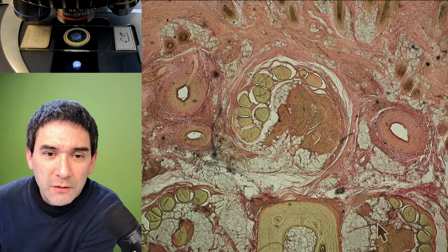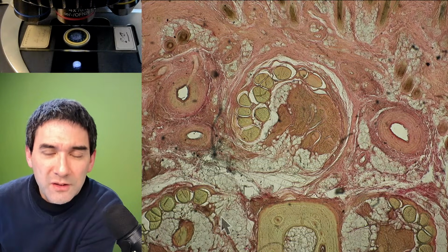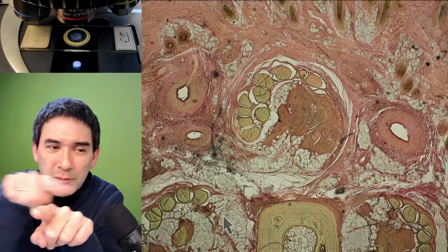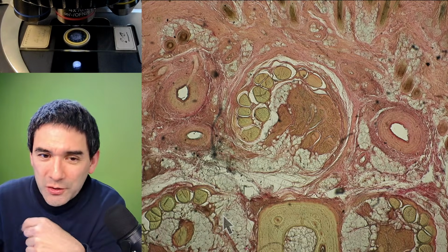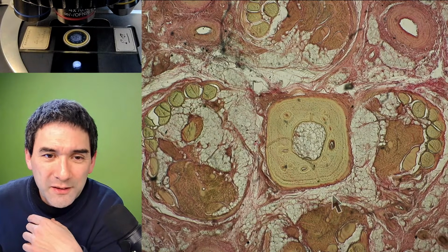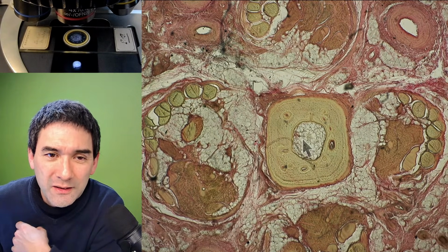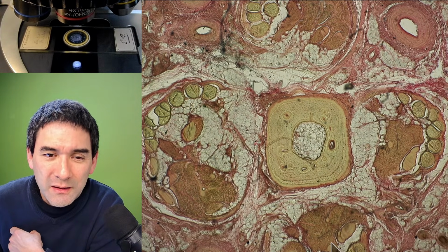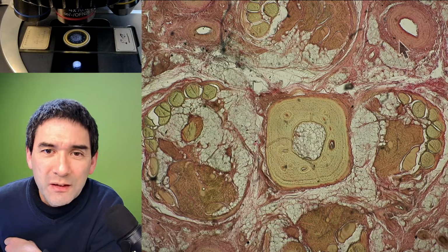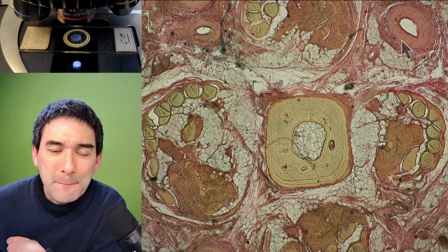You've got muscles over here. So it's kind of interesting. You've got basically a pair of muscles that are moving it like this, and a pair of muscles that are moving it in XY direction. Here in the center is the bone of the tail, and that seems to be the marrow. Again, muscle down here, up here, left and right as well. Those round things here are arteries, blood vessels. I know it's an artery, not a vein, because of the thickness of the wall.